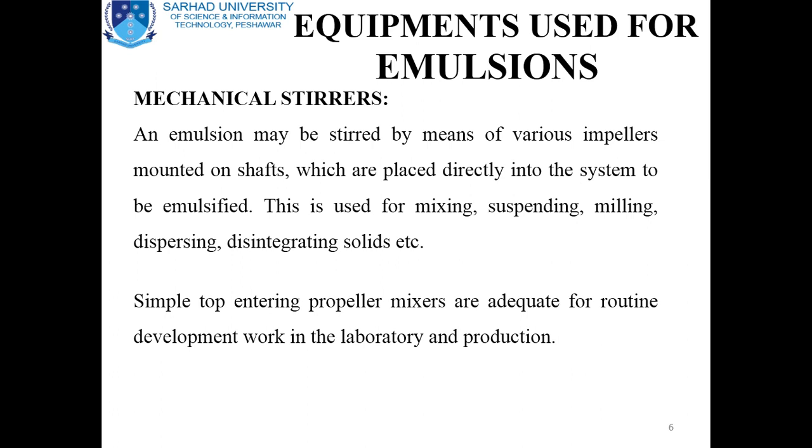An emulsion may be stirred by means of various impellers. These are mixing devices which are mounted on shafts, which are placed directly into the system to be emulsified. This is used for mixing, suspending, milling, dispersing, disintegrating solids.